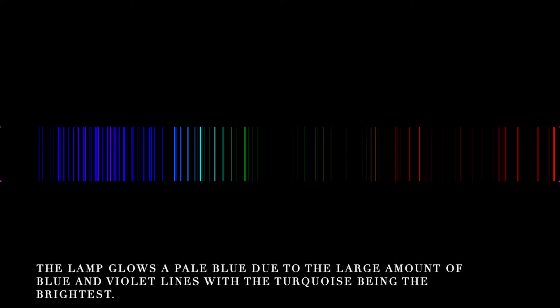We'll swap this one for argon. This one's bands are more difficult to see because many of them are in the UV spectrum, and we cannot see this with our eyes.